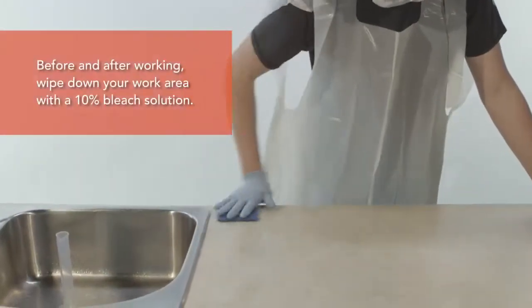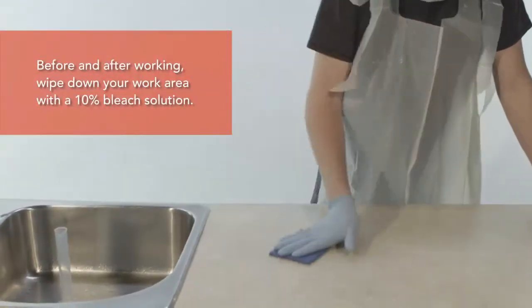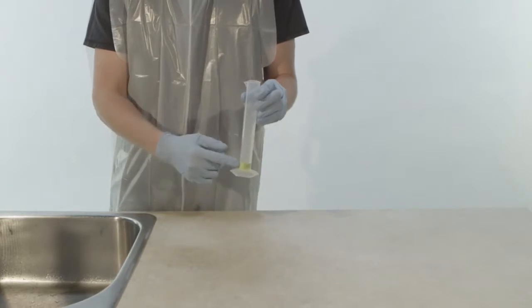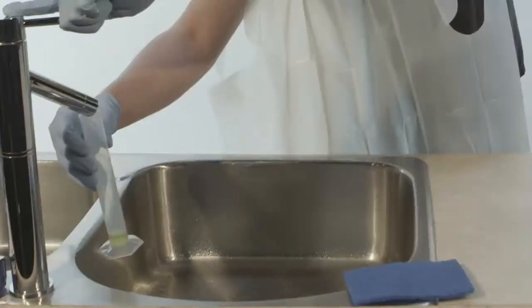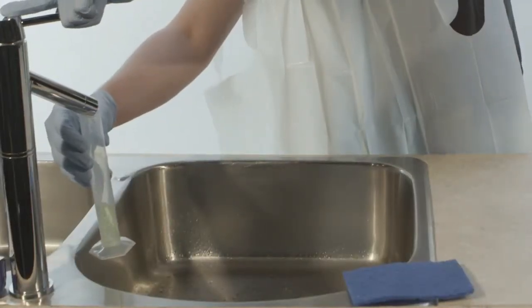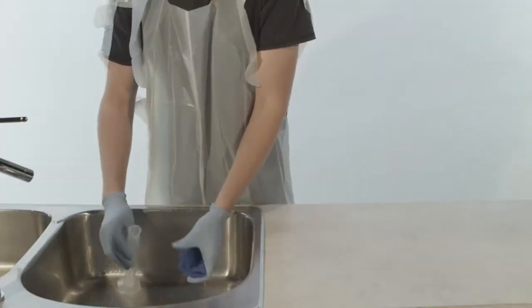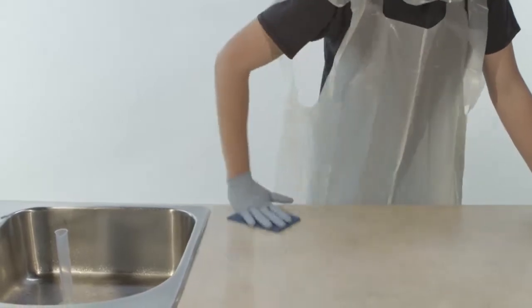Before and after working, it is important that you wipe down your work area with a 10% bleach solution. An easy way to measure out this concentration of bleach is to add 10 milliliters of bleach to a 100 milliliter graduated cylinder, and then fill the cylinder to the 100 mark. This can then be applied to a sponge or scrubber and used on the work area.